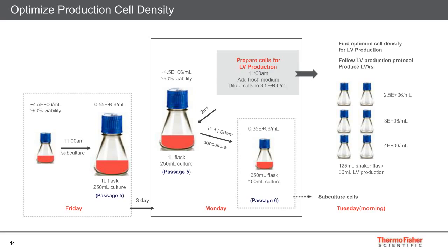And this is showing here the growth curve with the viability in the upper left, and you can see those cells can grow very fast and very healthy in a suspension environment. So you have the cells.